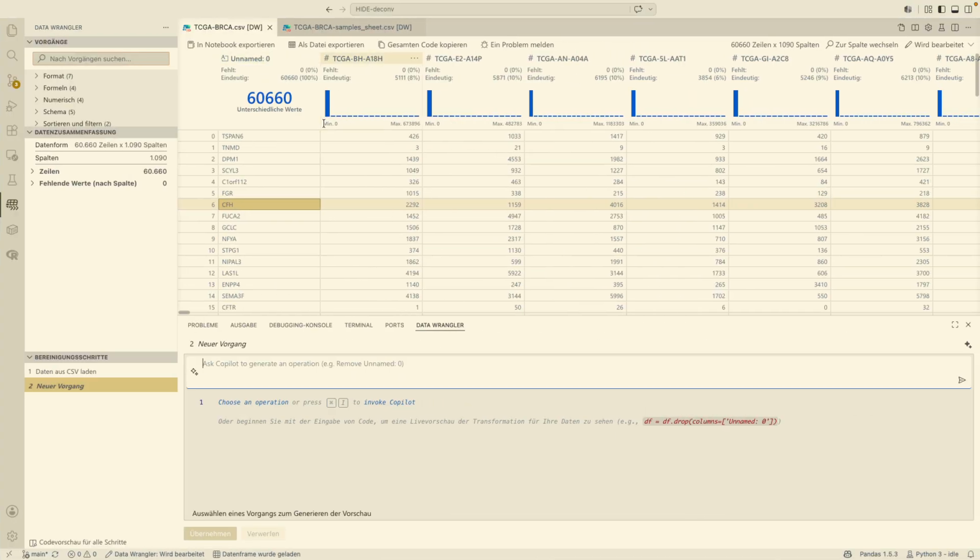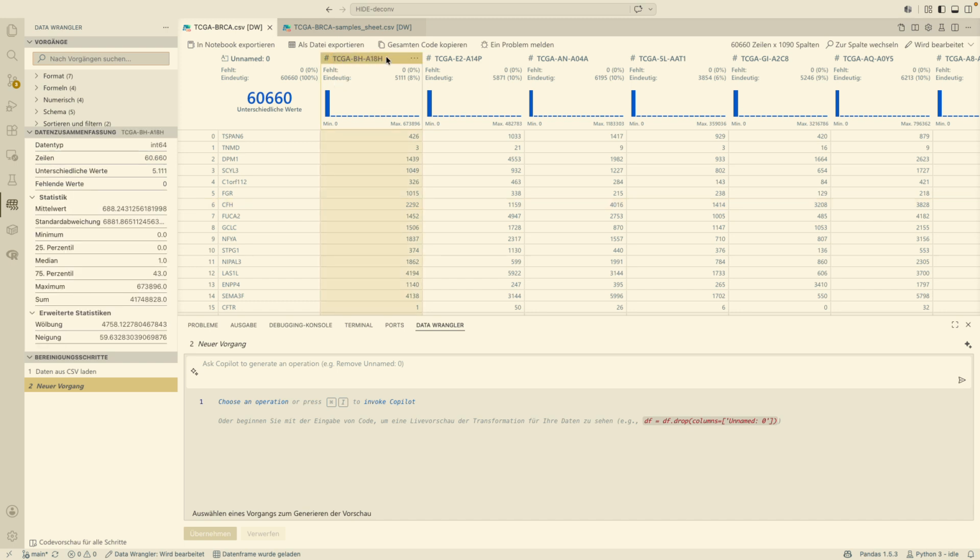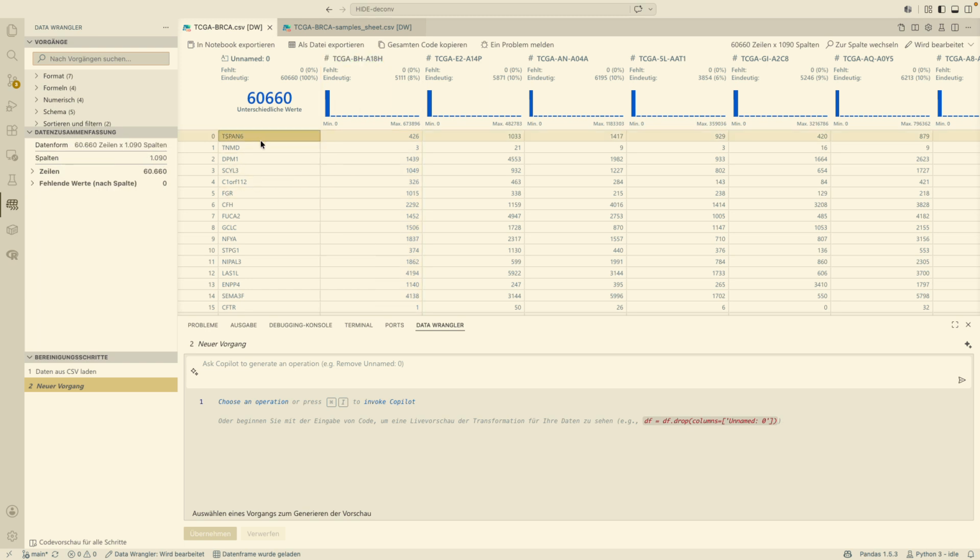The bulk RNA sequencing data, in this case, needs to have each measurement as a single column, with the column name being the sample ID and the row names being the gene names. You should, in the best case, use raw count data.